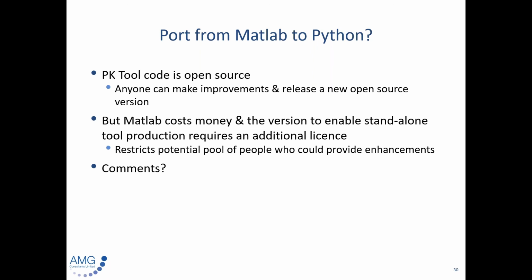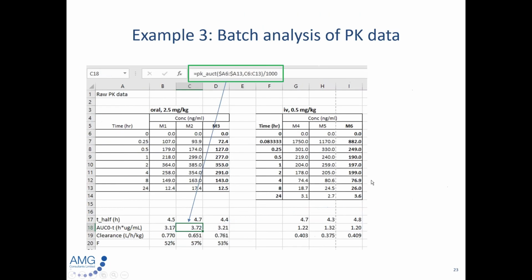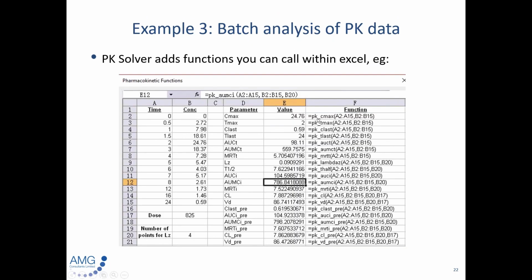Right. So you would recommend using the GUI front end rather than trying to do your own thing with the... Well, I think to a large extent, the list comes with a set of explanations of what it's doing. They're alongside the parameters that are being calculated here, and it tells you which data are required to generate those.